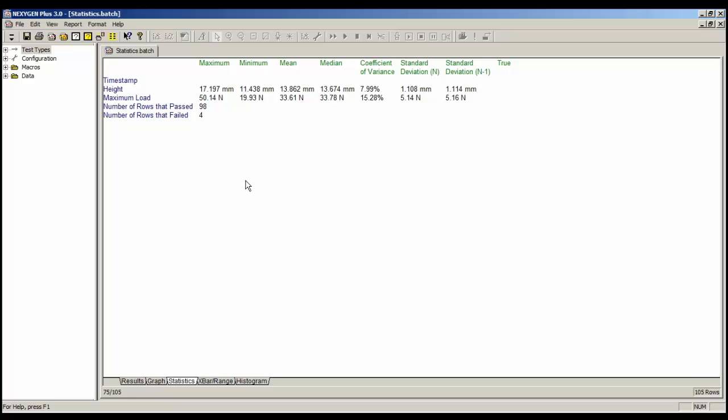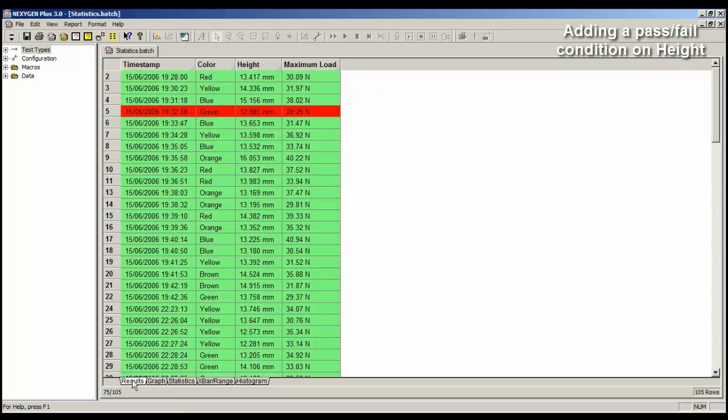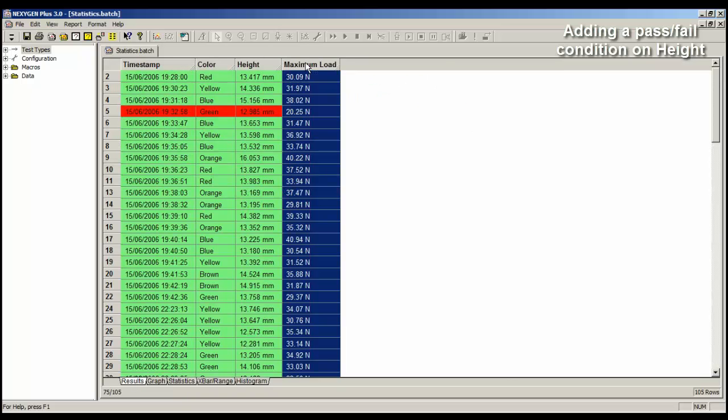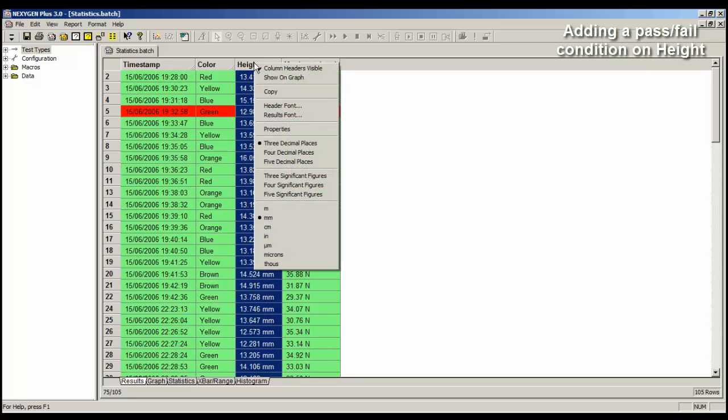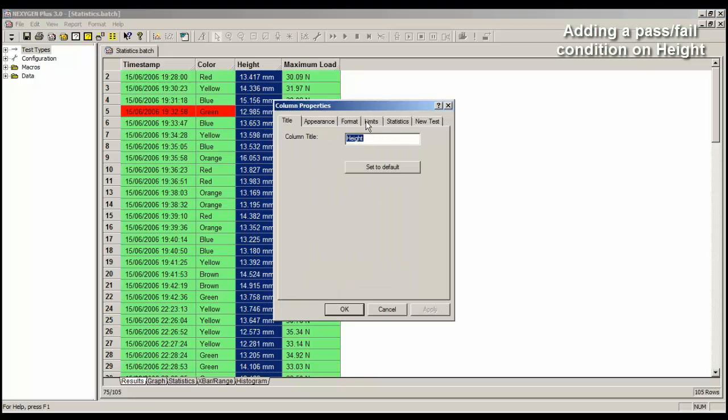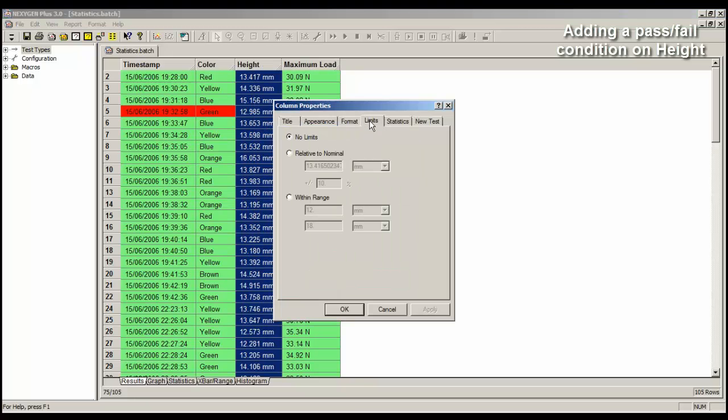Now let's add a pass or fail condition to the height result. So let's return to the results page. We've already got a pass or fail limit here. I want to put one on height, so again, right mouse click, properties, limits, within range.